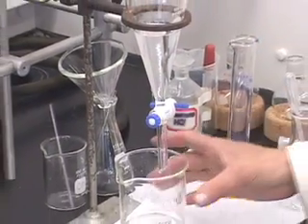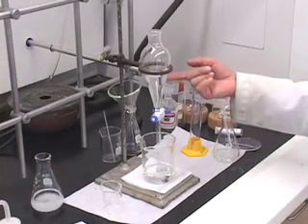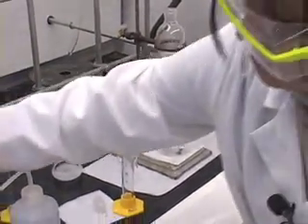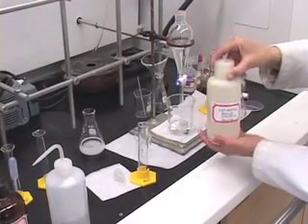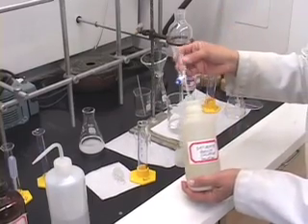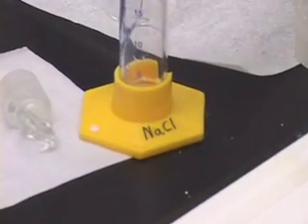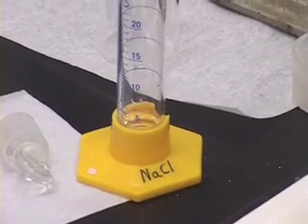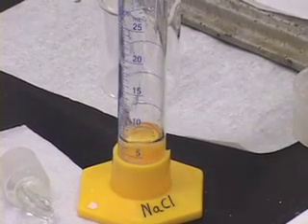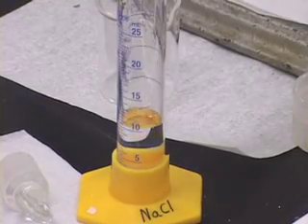Remember we have to dry this layer. So the same two-step procedure that we did with our organic layer — we are going to rinse this first with sodium chloride, 15 milliliters of saturated sodium chloride. Take about 15 milliliters in the graduated cylinder labeled sodium chloride and add it to the separatory funnel and do the extraction.